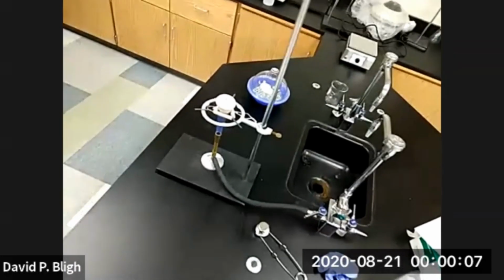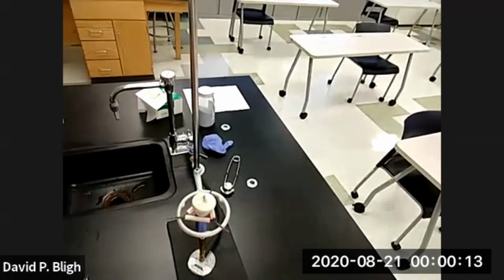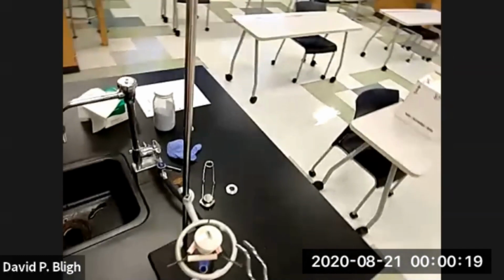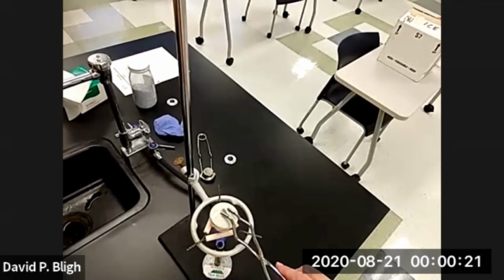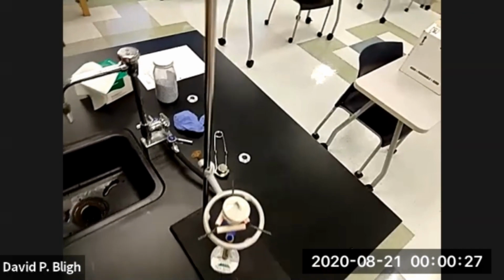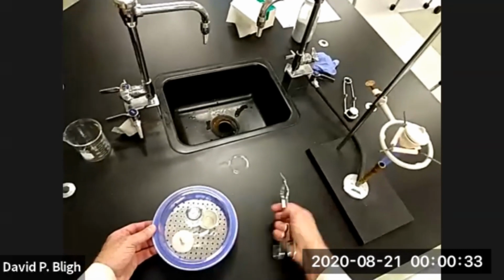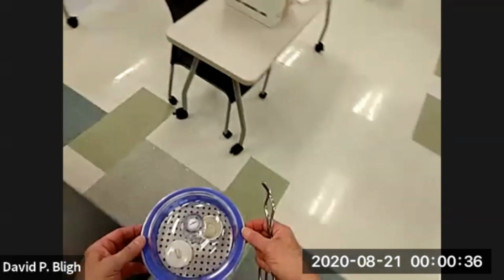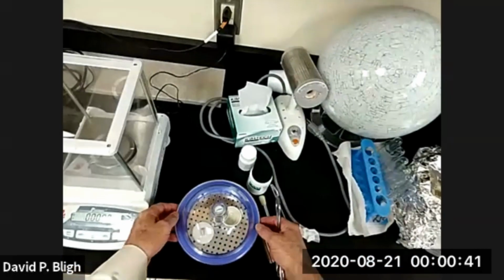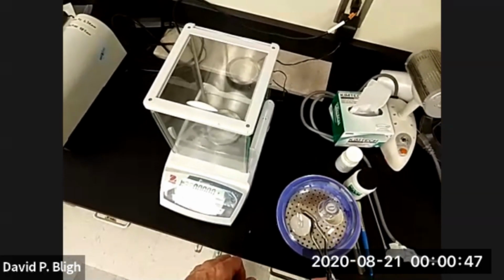And we still got a good ways to go. The thing about sodium hydrogen carbonate is you can't tell when it's done by color. Sometimes you can judge the appearance because it'll become more granular as it heats. This has still got a long way to go. It might take more than 10 minutes on that one. But what we're going to do is we're going to take our copper sulfate and put it on the balance and see if it's stable. Okay, we're back down to 0. Good thing.